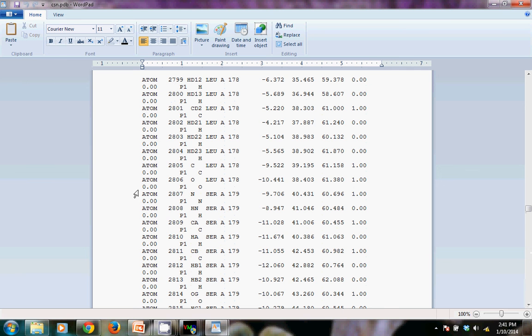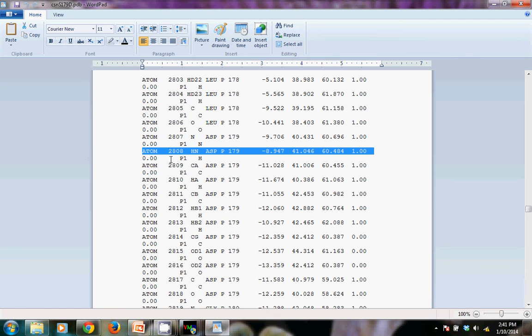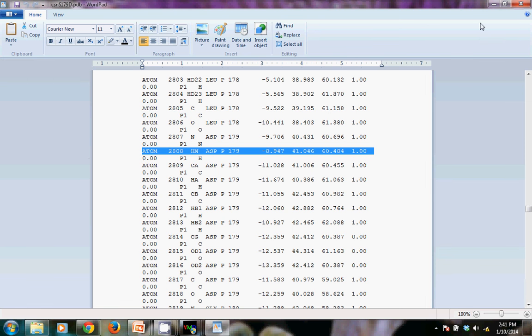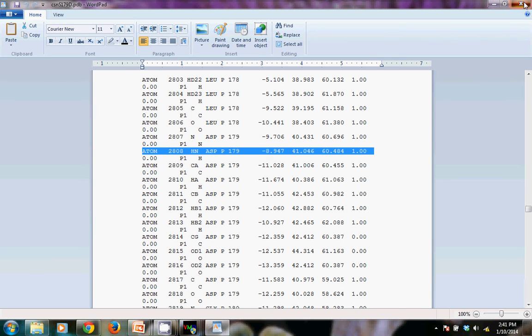And it's now been mutated to 179 aspartic acid in the new file. So it appears that our mutation has happened the way we expected. And so we're ready to move on to the next step.